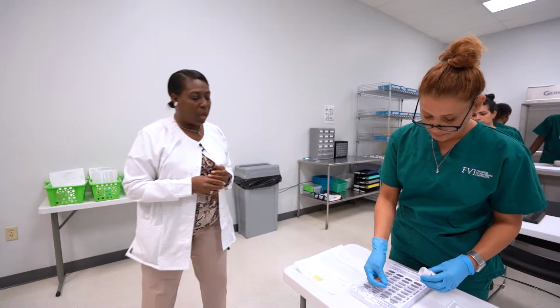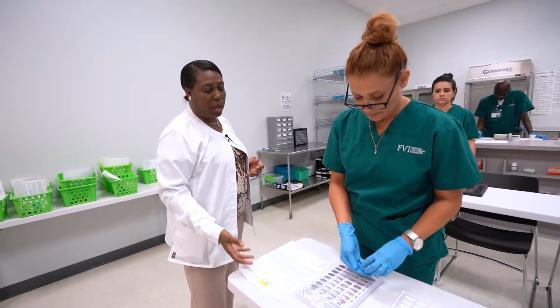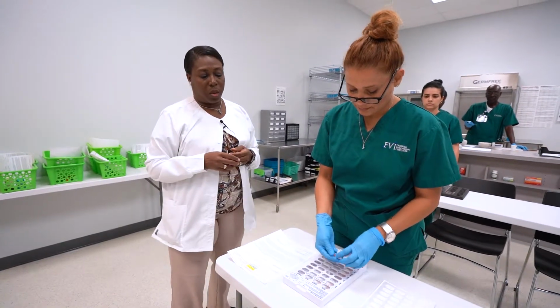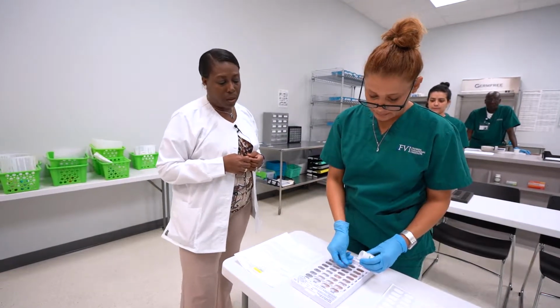So we have Bertha here today, and she's doing Blister Pack, or what we call bingo card. So here in this step, we have a label just like before, and she's putting the medications into the blister card. So once she's completed with that, this system or this method is called self-adhesive method.